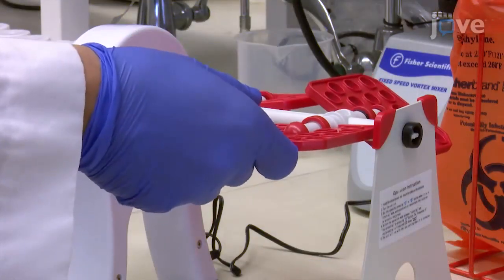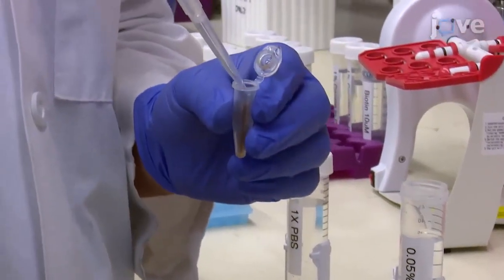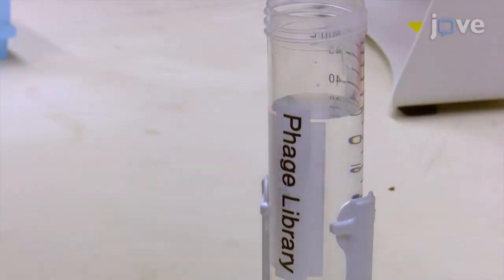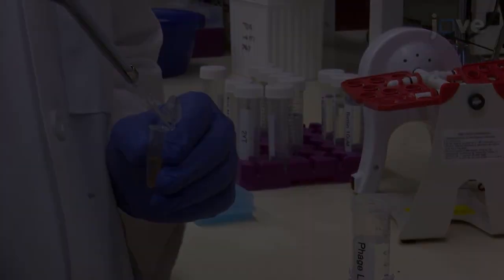After one hour at room temperature with rotation, wash the beads five times with PBS-Tween and three times with PBS as demonstrated. After the last wash, add approximately one times 10 to the 13th phage particles in one percent casein.